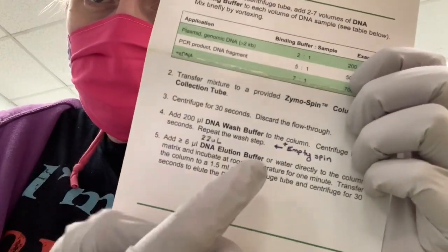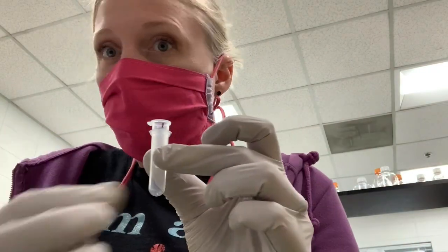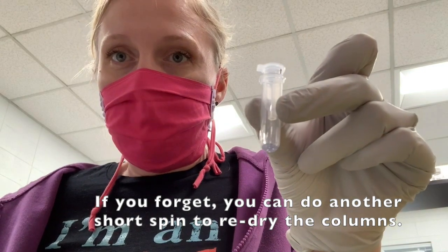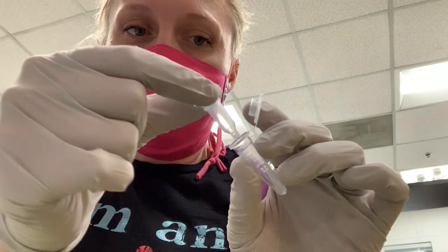So that clearing spin we did where we had the empty tubes is not actually on the protocol, but you can see sometimes people will write it in. As I mentioned, that last spin is just to get all of the wash buffer ethanol off the tubes. After that step, there will be just a little bit of ethanol and wash buffer at the bottom. You don't want to dump that out, or else this will be along the side of the tube and get back on your column. So what you want to do is take this directly out of the centrifuge and either put it in your rack, or take your column out of the collection tube and place it in the 1.5 ml tube that you have labeled. And this is where we are going to elute your DNA from the filters that are in the columns into your tubes for their use.